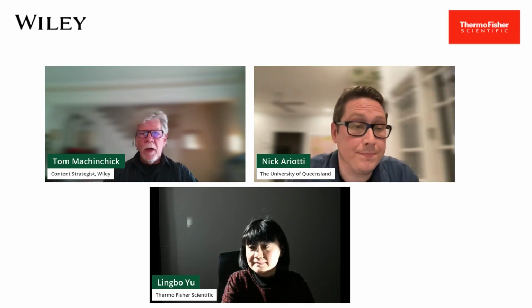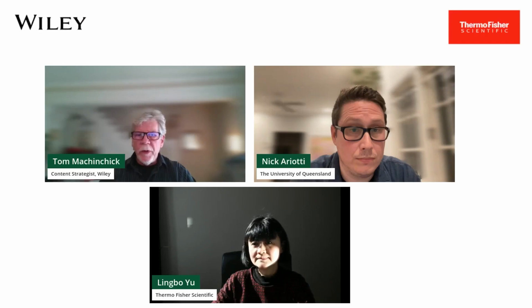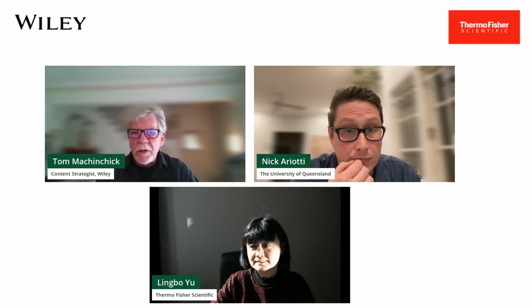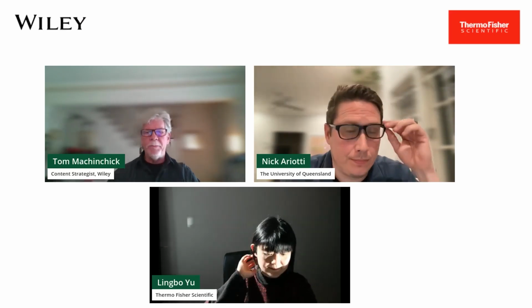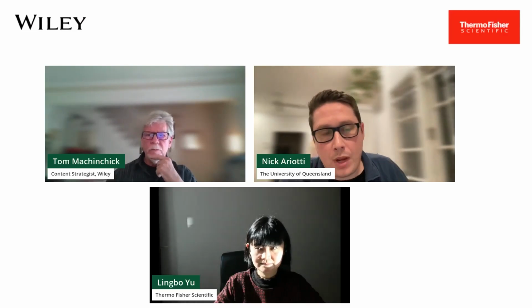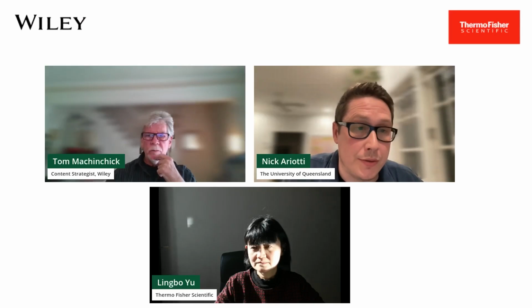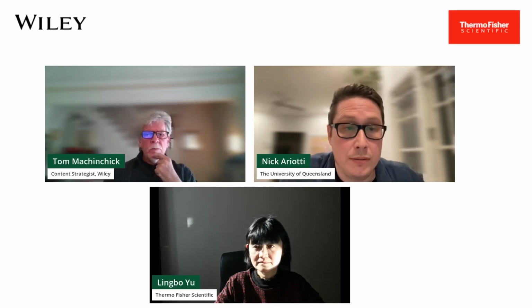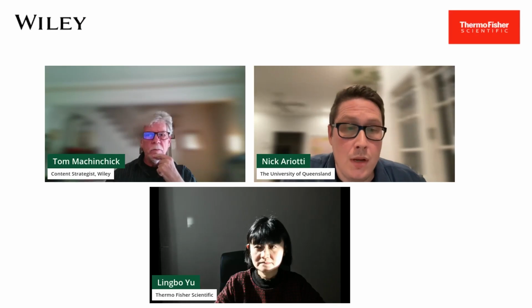Okay. This is for Dr. Ariotti. What other equipment do you have except for the Glacios 2? For example, cryofluorescence microscope, high pressure freezer, etc. Yeah. So for the lab, we have high pressure freezers, and we also have plunge freezers. We have a Leica EM GP2, and we have a Vitrobot as well.